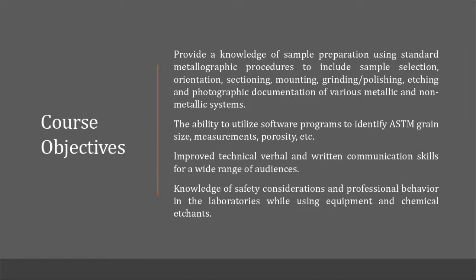And when I say standard metallographic procedures, I'm essentially combining in a package sample selection, the orientation, sectioning, the mounting, grinding process, etching, and the photographic documentation that you'll be utilizing to complete the metallography for any type of material system.